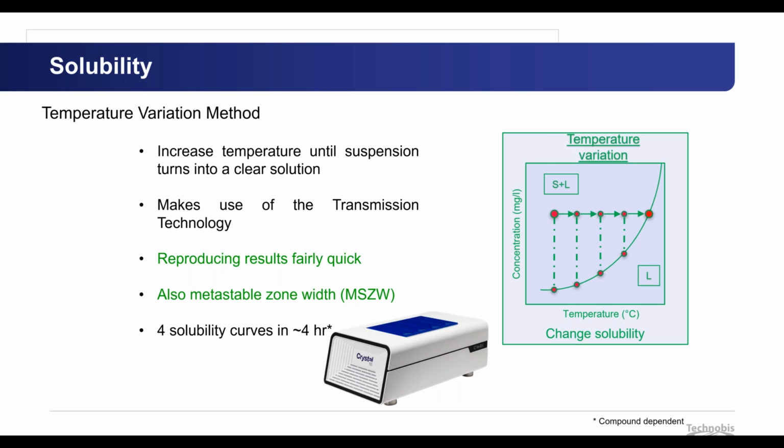Think about it. If you take one block reactor for one solvent, and you have in the Crystal16 4 block reactors, you can already have 4 solubility curves in 4 different solvents, in a very short time, in a few hours.